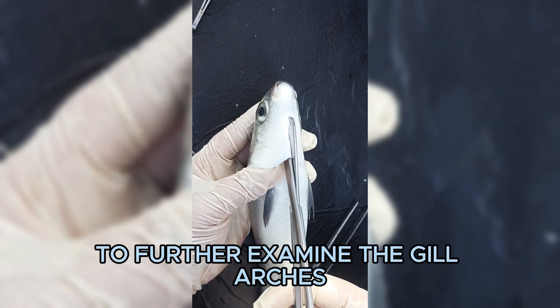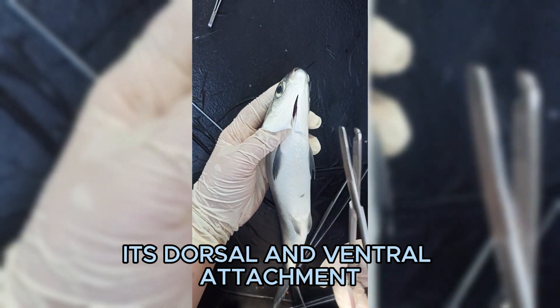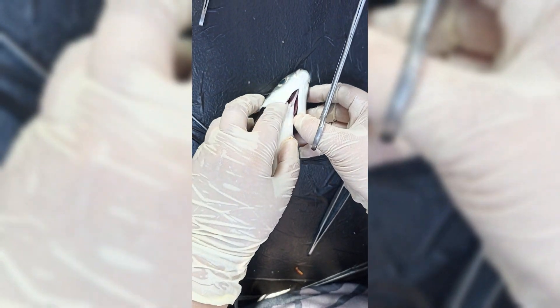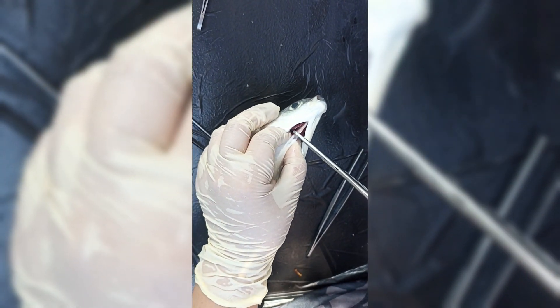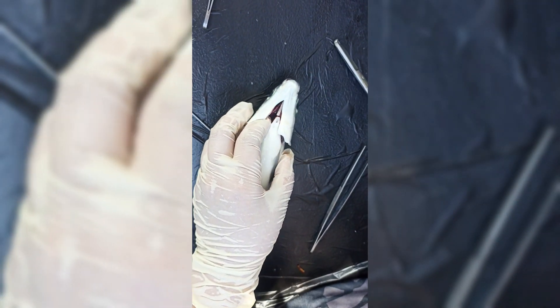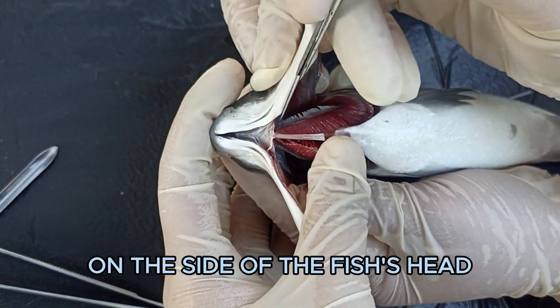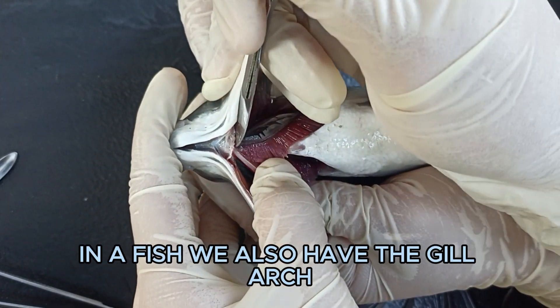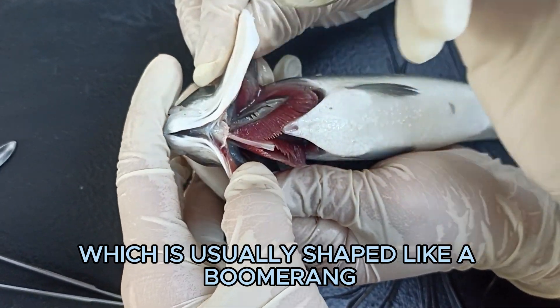The pectoral fin is located on the side of the body and used for steering and locomotion. To further examine the gill arches, remove them by cutting the dorsal and ventral attachment. Gills are the organs located on the side of the fish's head. Gill filaments provide a way for oxygen exchange in a fish. The gill arch is usually shaped like a boomerang.